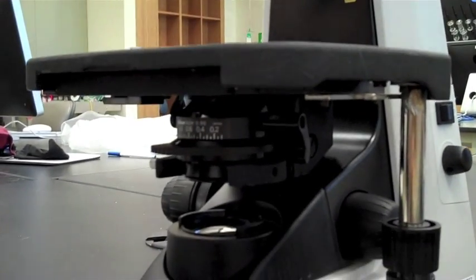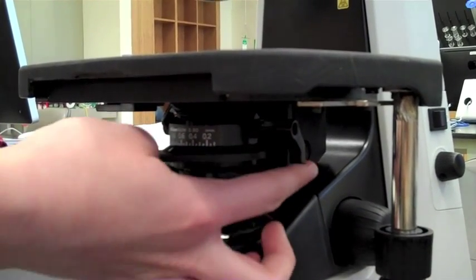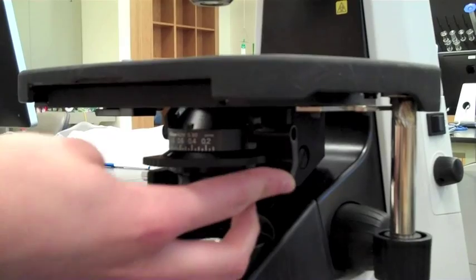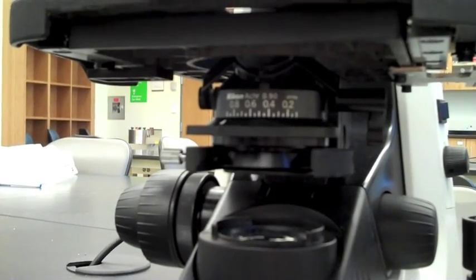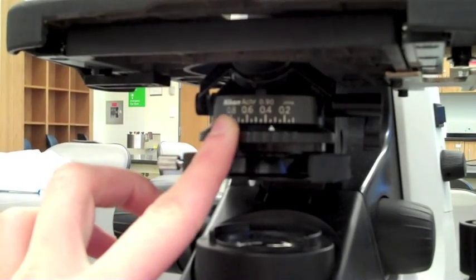The condenser lever restricts the diameter of incoming light. At the 2x objective, it narrows the field of vision. At higher objectives, it is useful for amplifying brightness. The condenser adjusts the light for each objective lens. The number on the condenser should match the number on the objective lens.